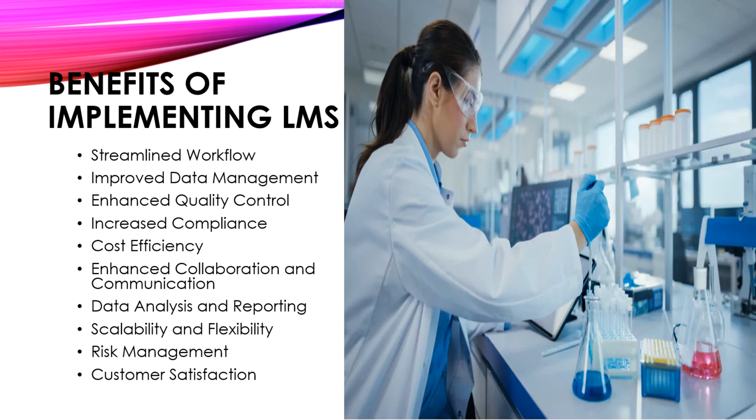First, streamlined workflow. A laboratory management system facilitates efficient management of laboratory operations by automating and streamlining various processes such as sample tracking, data management, scheduling, and reporting. This leads to improved productivity and reduced turnaround times.